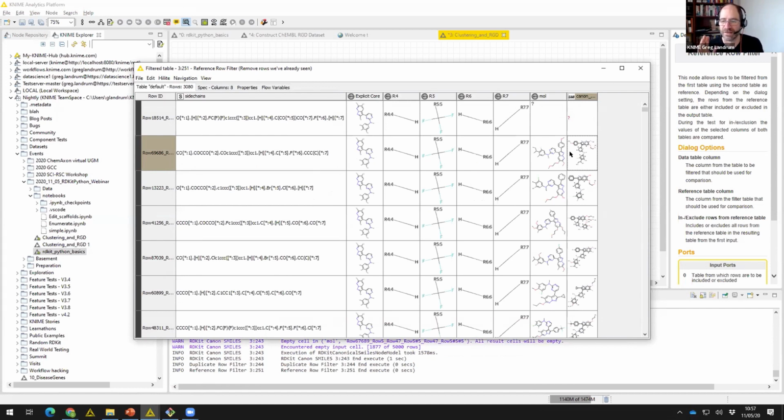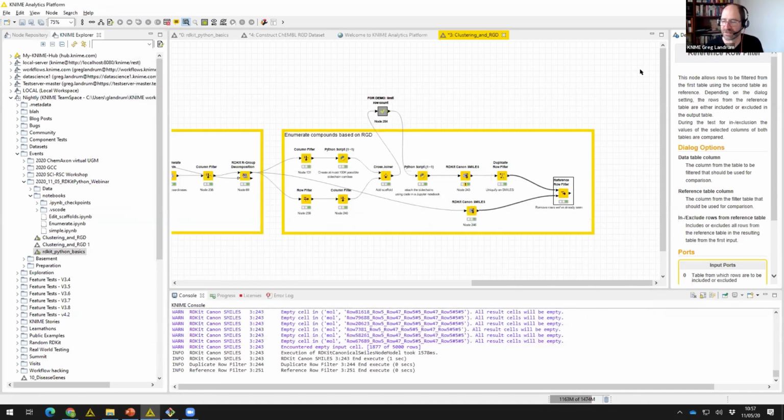This is somewhat fragile. So you can see sometimes it fails, right? Sometimes it builds a molecule that the RDKit just won't accept. So you don't always get successful molecules out. But this is just a nice way to see what could have been in that data set and wasn't. That's in terms of the overall workflow. Good. So this is the workflow.